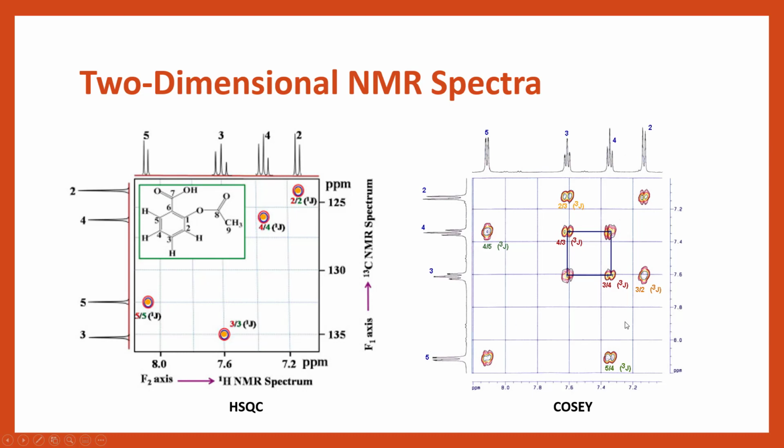We can also compare proton to proton. So again, this is of aspirin. And again, these are the type of peaks you get. So you can go across, you can find out what they correlate to. And it's just another nice way of confirming your information.